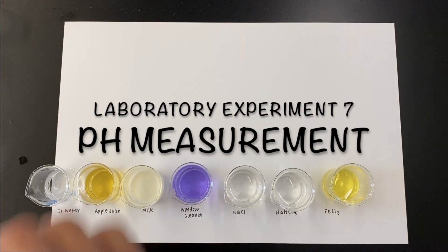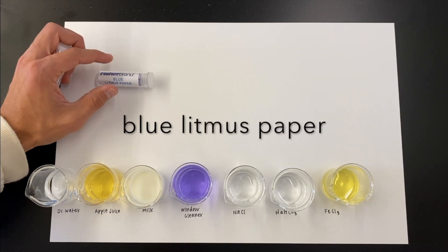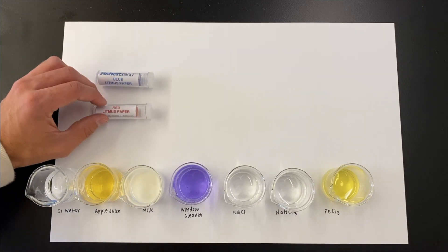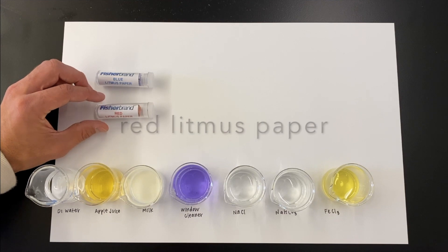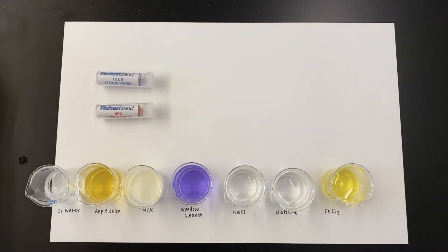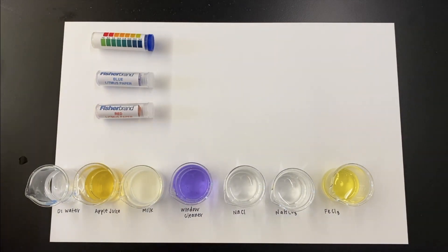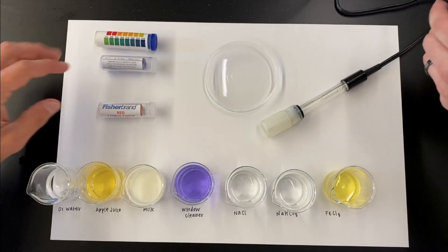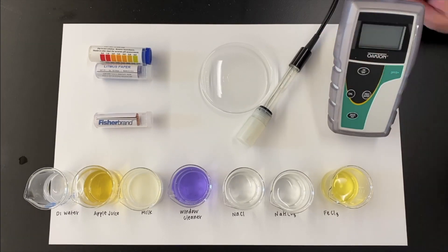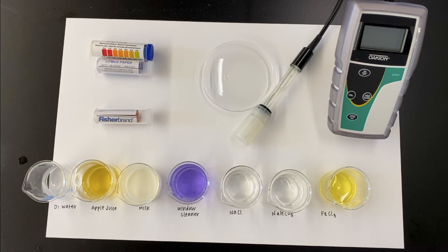Welcome to laboratory experiment number seven, pH measurement. We're going to start along with the procedure. First, we're going to obtain our blue litmus paper, our red litmus paper, and finally our wide-range pH paper. This is good for measuring color to figure out what pH certain solutions are — a little more specific than just generally acidic or generally basic. We also have a pH meter and electrode, which we'll get to later in this video.